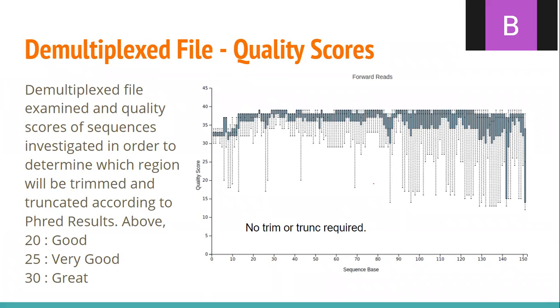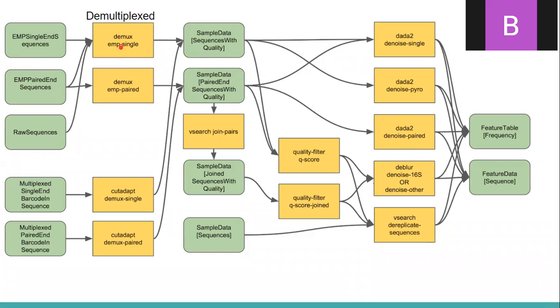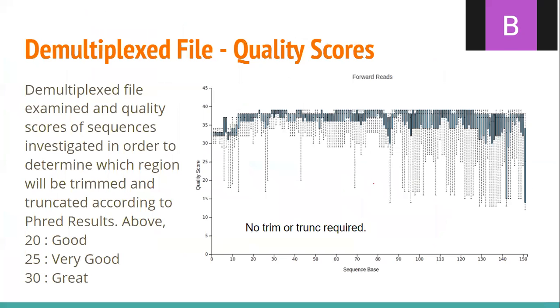We use the demux plugin, as I've shown here, emp-single in the code, which is detailed in the project report.